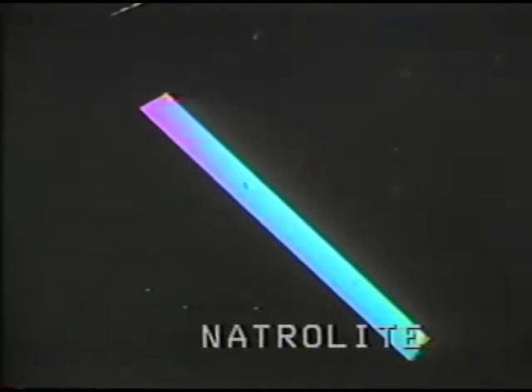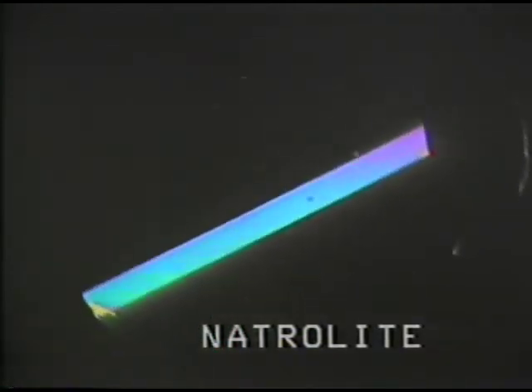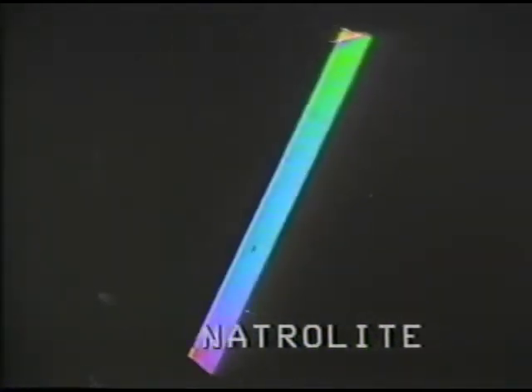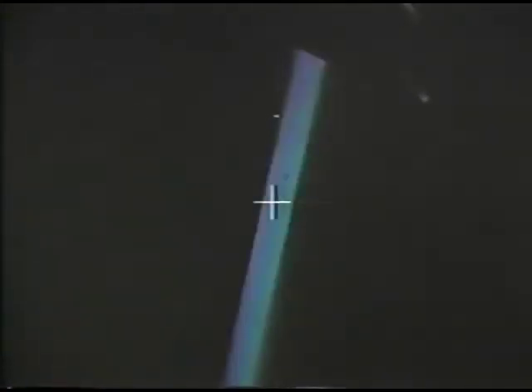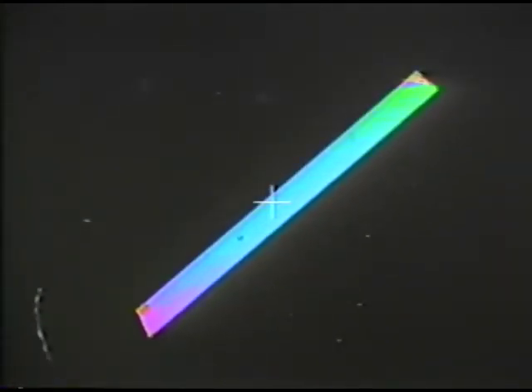So here we can see the natrolite grain, and as I rotate, you can see very clearly that extinction, or darkness, on this grain in cross-polarized light occurs when the mineral grain is precisely east-west or north-south. If this were not the case, then you should adjust your polarizer in such a way that it becomes precisely north-south and east-west. And now you're ready to look at petrographic specimens with the petrographic microscope.